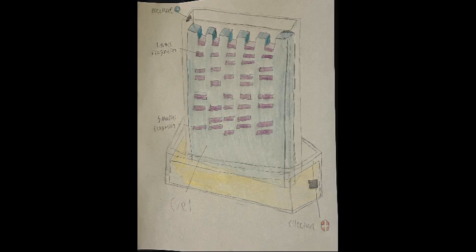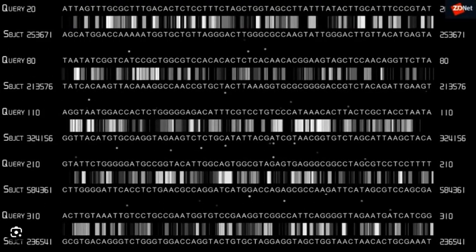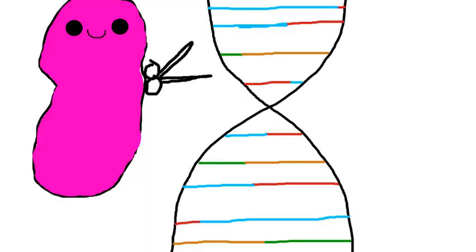After the DNA is collected from the capillary electrophoresis, or gel electrophoresis, it gets attached to a CE instrument and then put in a software in which the DNA profile can be made.